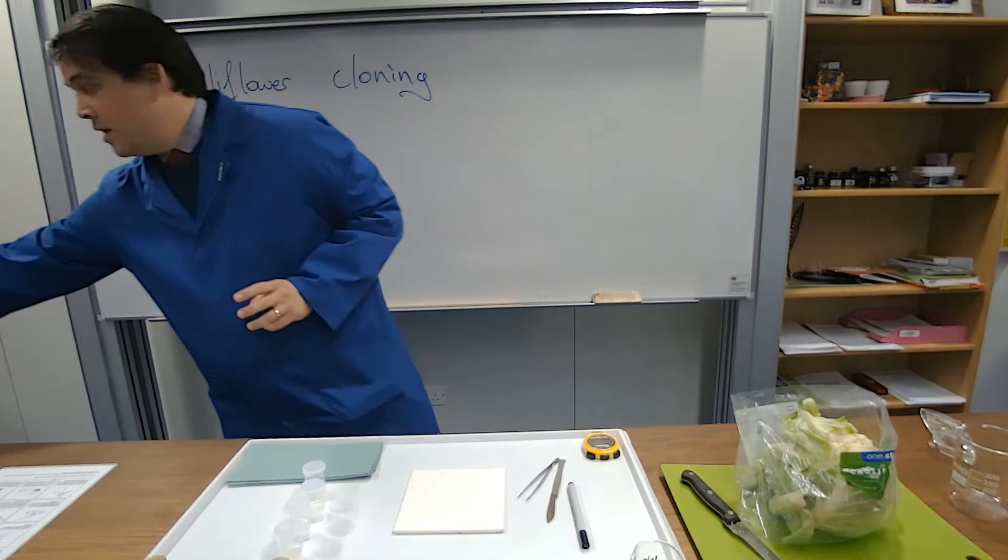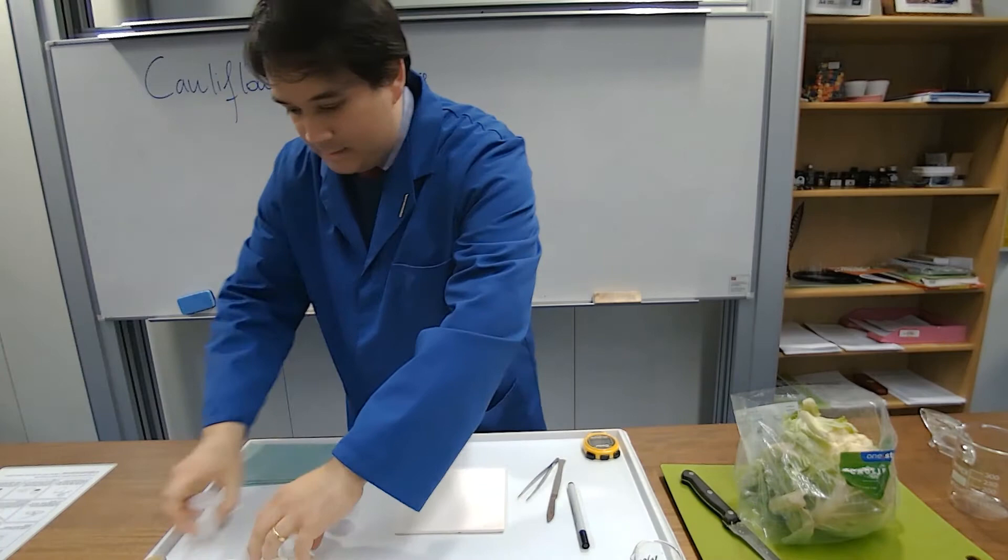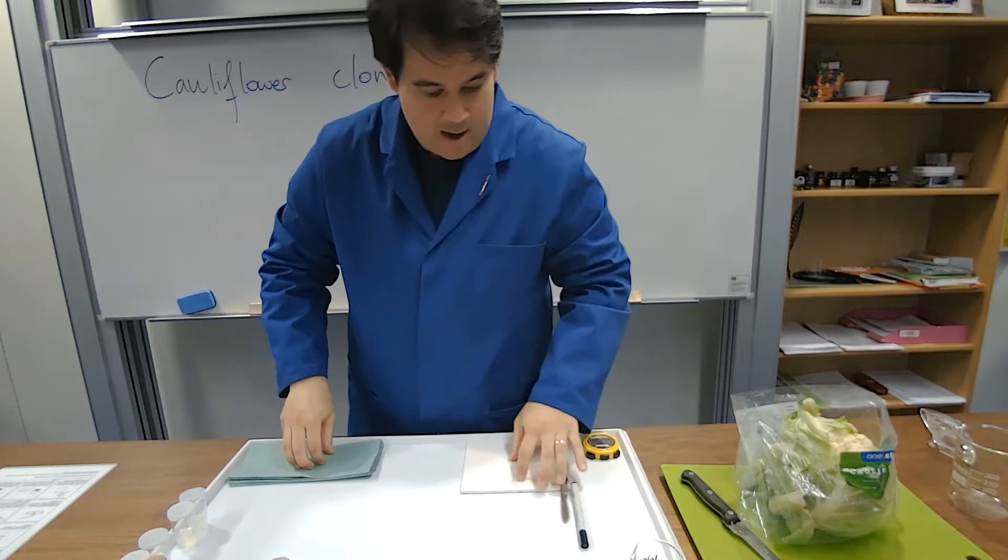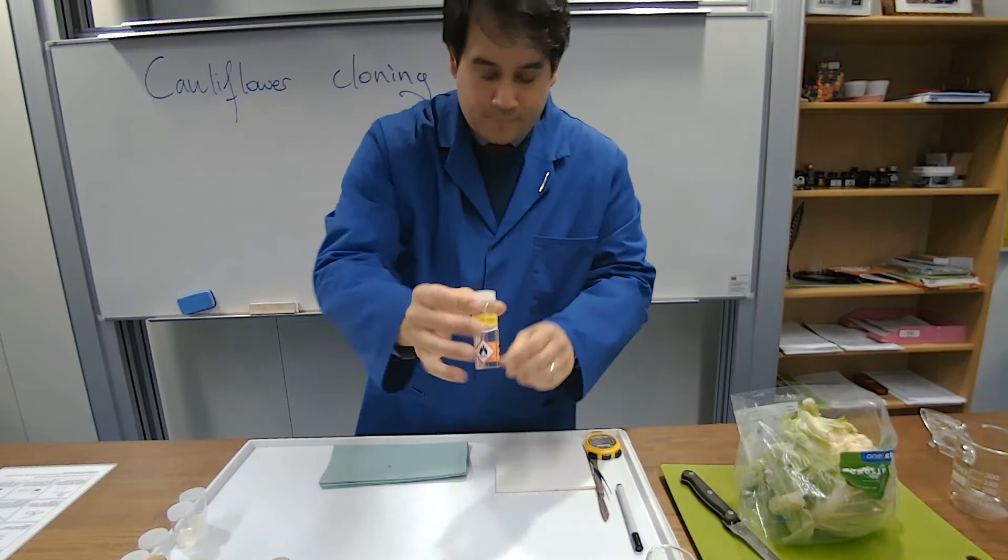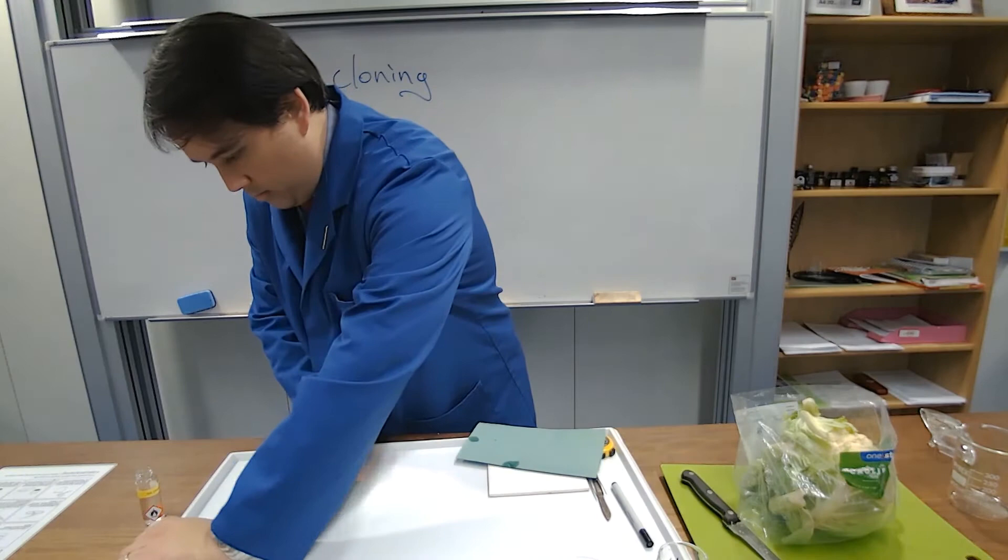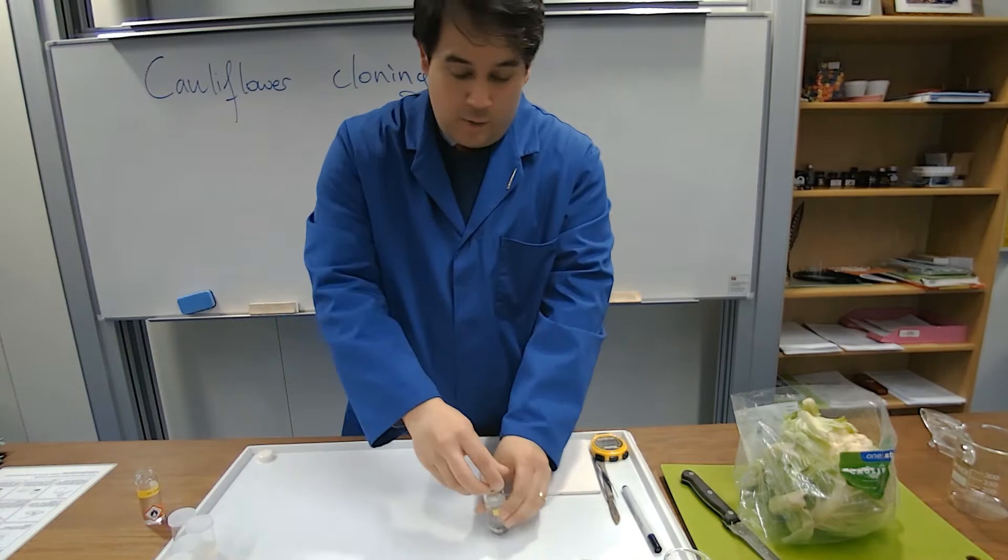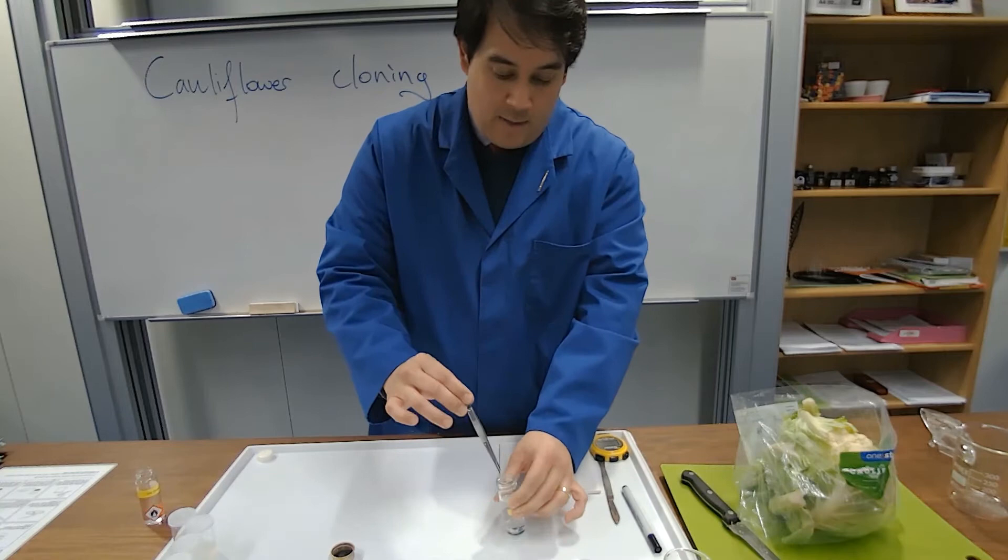First things first, I bet you missed the smell of this then. I'm going to sterilize my equipment as well as my work area. So let's just get this off to the side for a bit. As much as possible, I'm spraying all over this, but hey, ethanol, just to clear away everything. Okay, that's good enough. Next, we want to make sure that my forceps are equally present and clean as well, because I'll be using that to handle the cauliflower. So again, that goes into some ethanol as well.